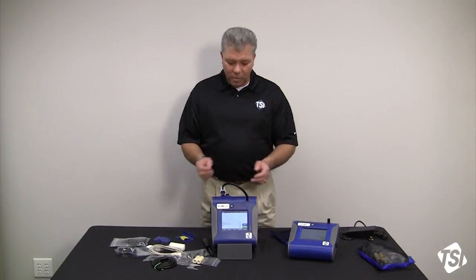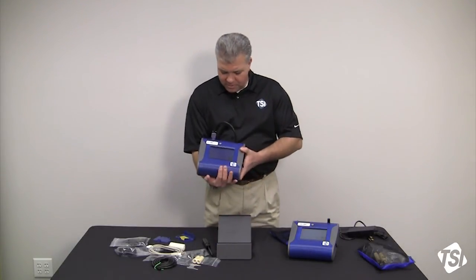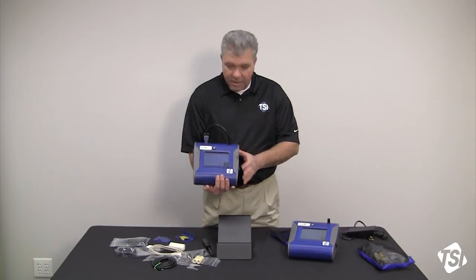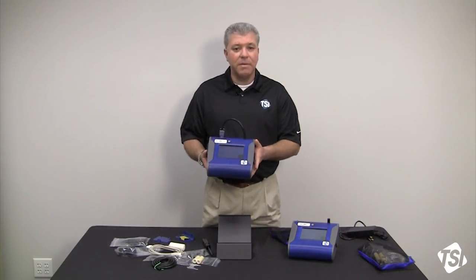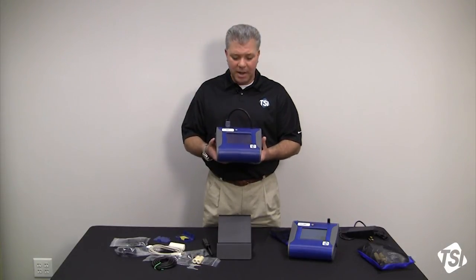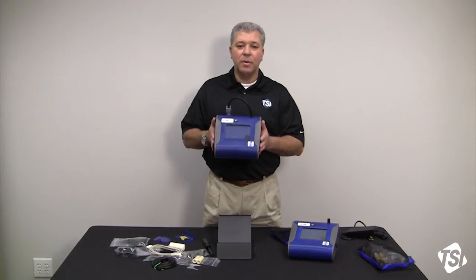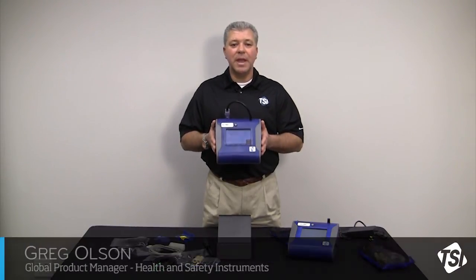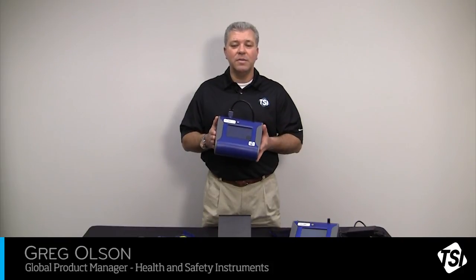After you get the instrument turned on, just hit the green start button and the instrument will start in survey mode — you're not taking any data yet. Your DustTrak 2 or DRX is up and running and ready to provide you with real-time data. We'll see you again with more product training videos from TSI.